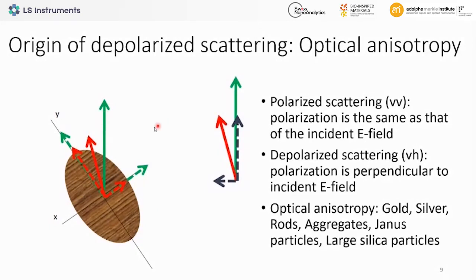So this is now copied here. It means this depolarized field has two components in the coordinate system of the incoming laser: one parallel, one perpendicular. When we observe the perpendicular component, this is what we call depolarized scattering, and the parallel one is what we call polarized dynamic light scattering. When we do not have a polarizer, we observe the fluctuation of this vector, and this is standard light scattering.